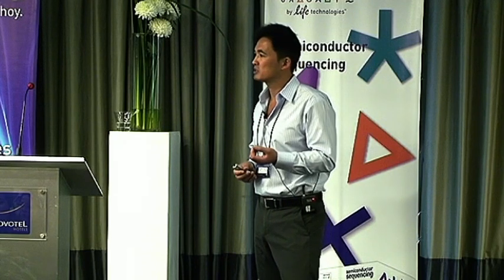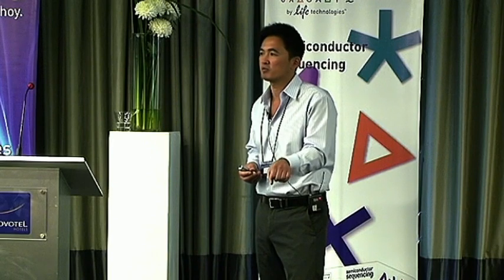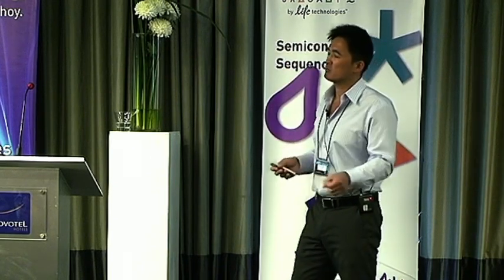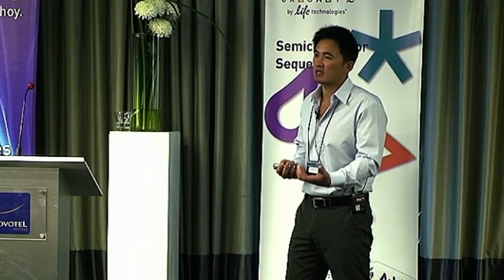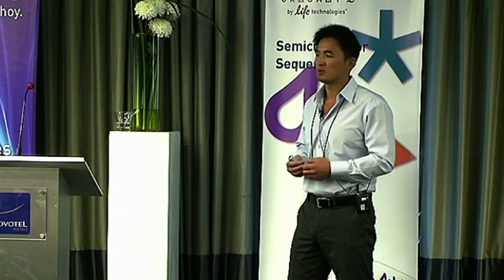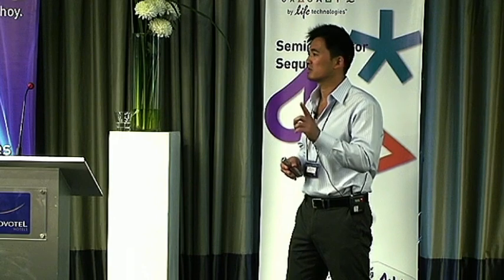These somatic mutations are present, let's say, in a tumor sample at a very, very small frequency or small percentage. If this mutation is off by a single base, it's just a single base polymorphism, how can we actually interrogate and recognize that polymorphism when it's in the presence of a dominant wild-type background? A dominant wild-type background that's identical genetically with the exception of a single base.